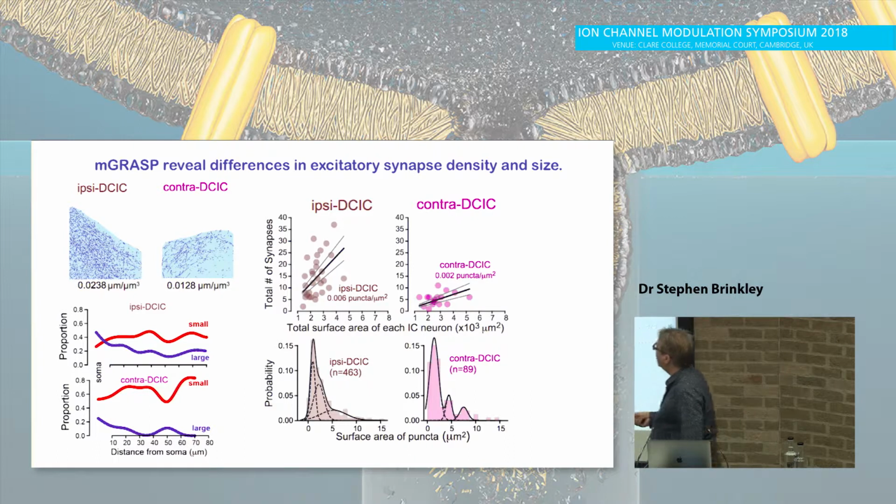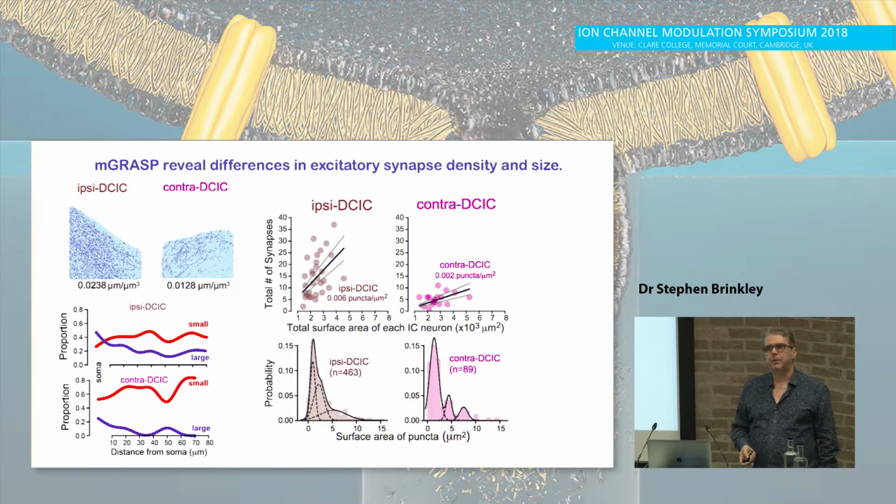This was looking at the surface area of the puncta. We then looked at their distribution, and I convinced myself over a few months that there were actually 3 peaks to that distribution. So we had to do quite a lot of thinking about how we bin the data and how we fit the data, and we decided there were 3 peaks. And we decided that the biggest component of the peak in the ipsi were these large synapses, whereas in the contra, the small synapses dominated.